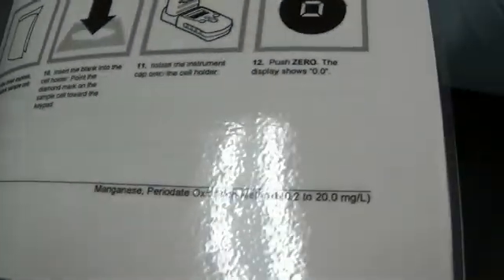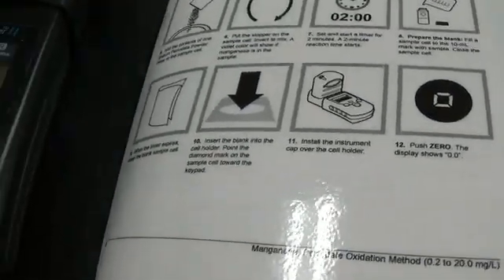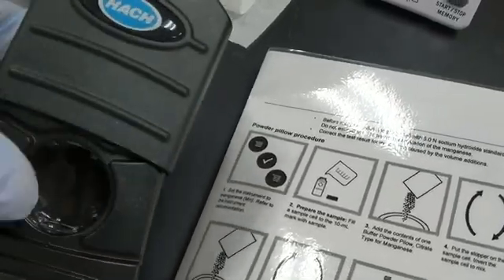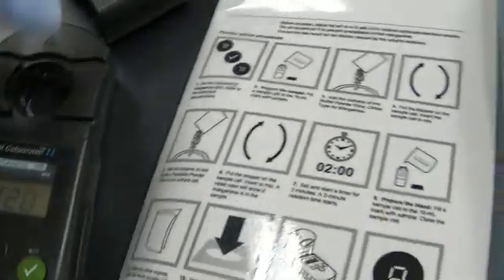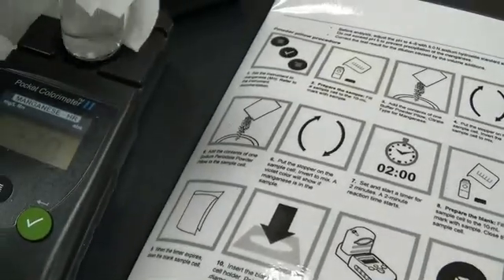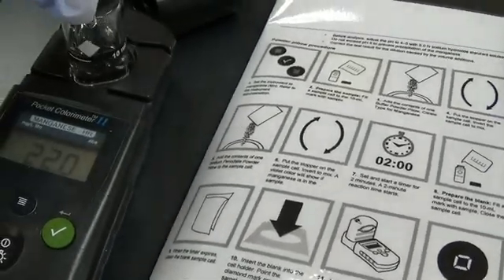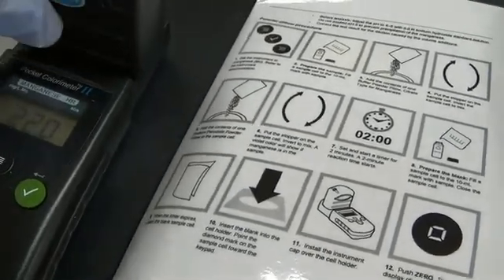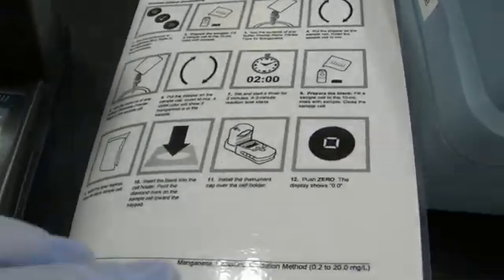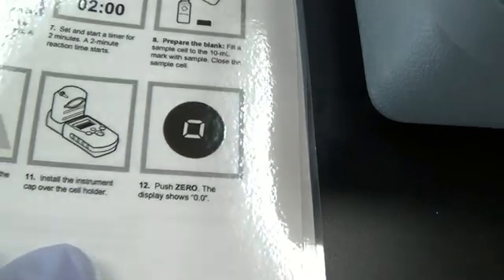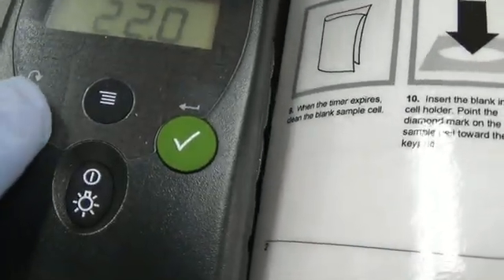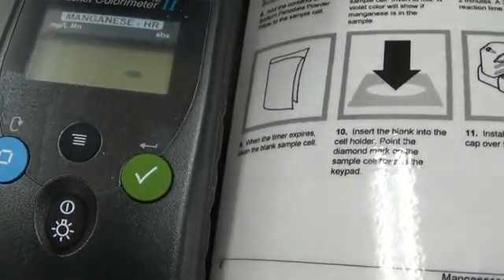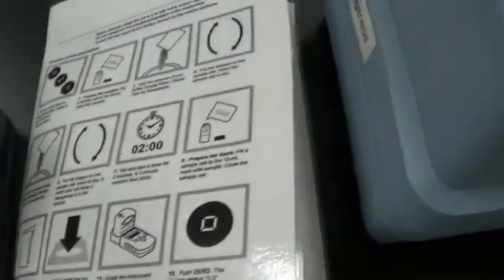So I poured it in. Now I've got to wipe it and I'm going to read it. Get my blank and wipe it and insert it facing forward, covering it. Then we push the zero button. It is zero.